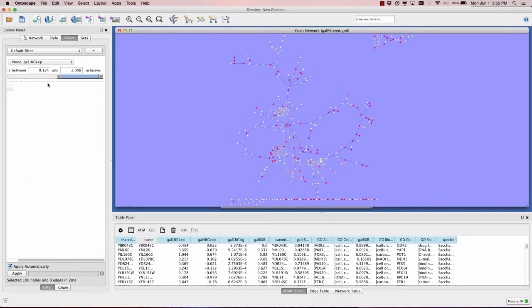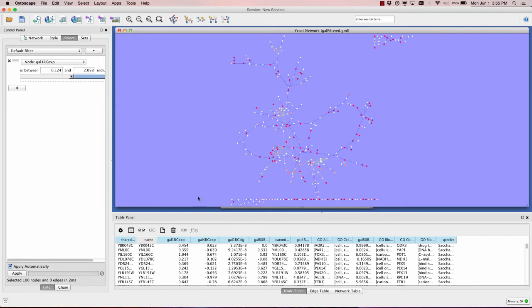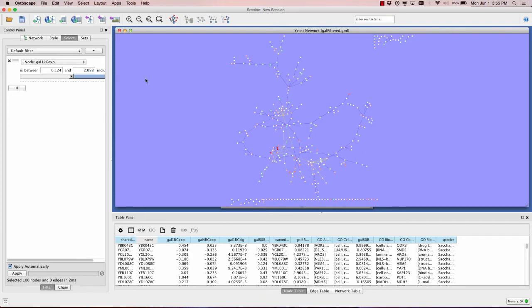The filters can be made arbitrarily complex and you can chain them together. Whatever data you have associated with the network, you can filter on. This demo isn't really explaining how to use Cytoscape to answer specific questions - it's really just to give you a quick overview, some of which you've already seen and others you haven't.